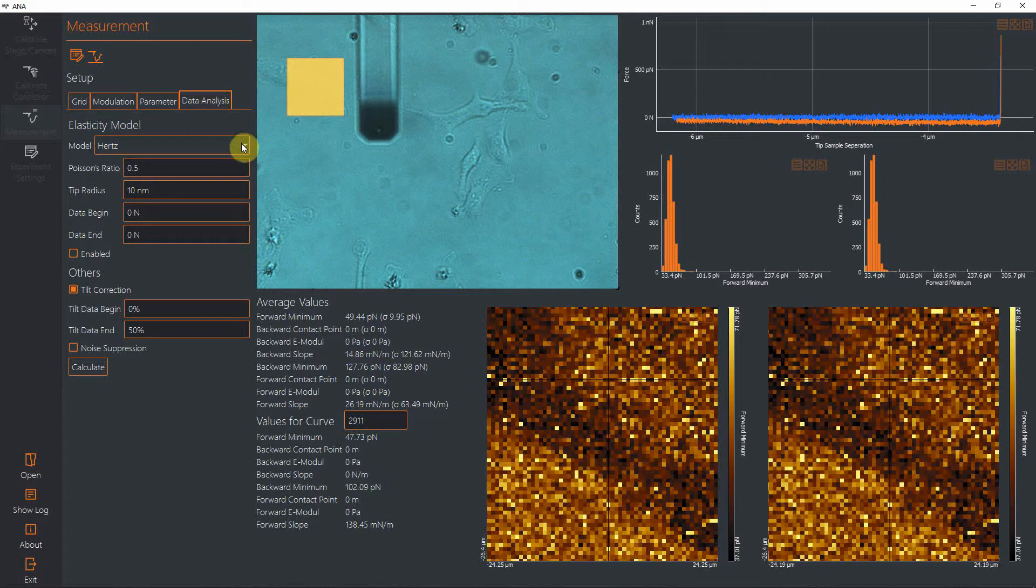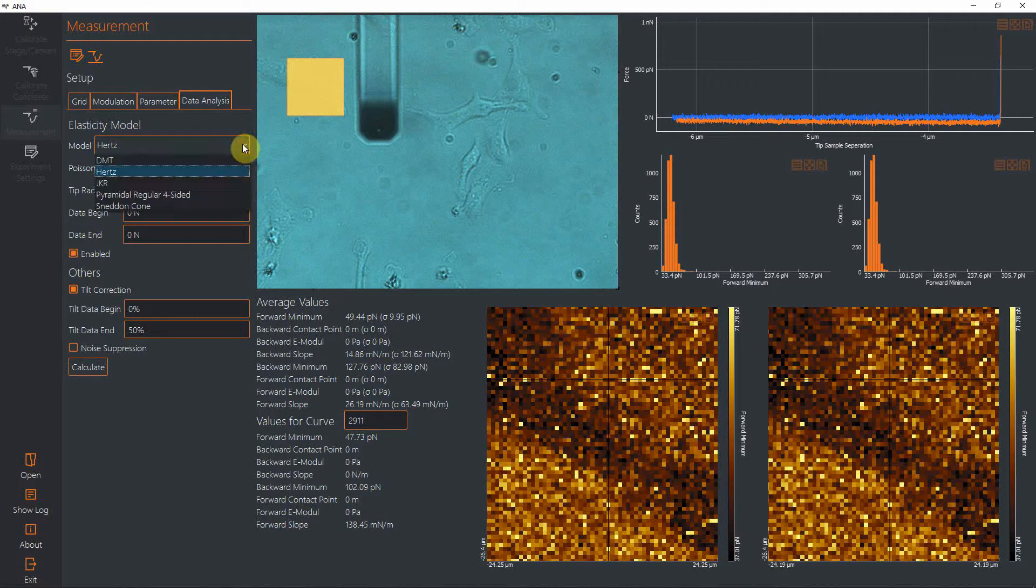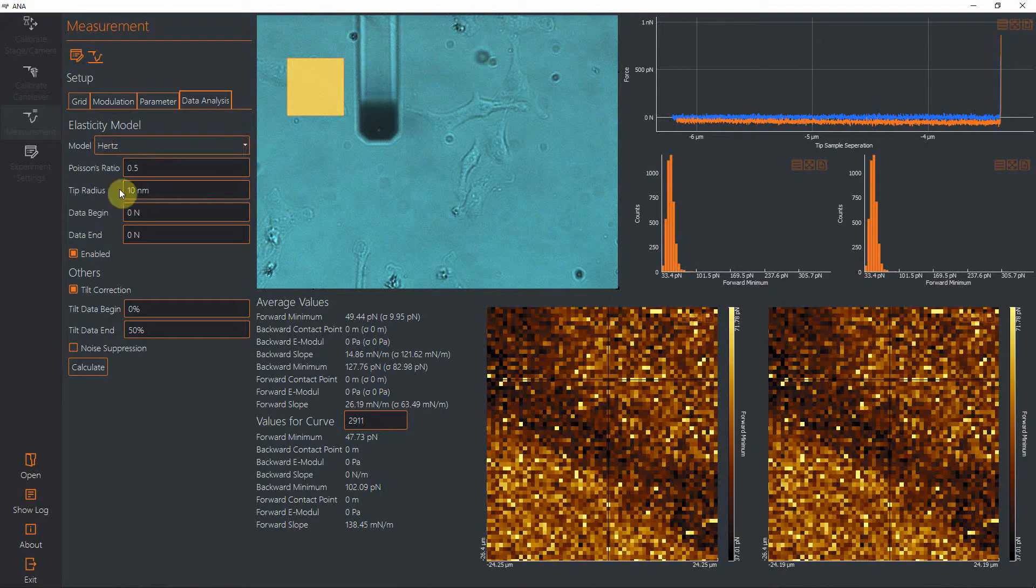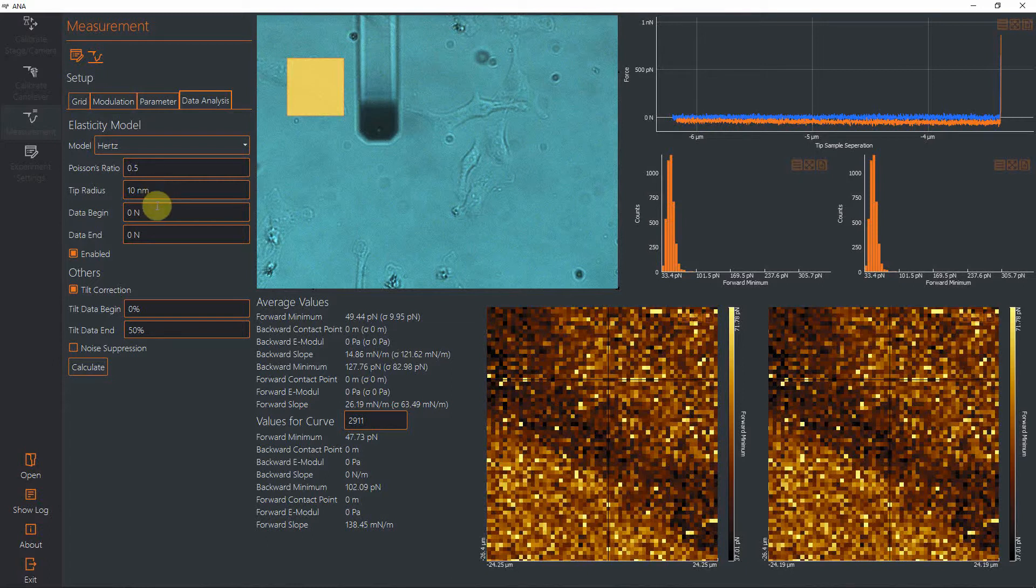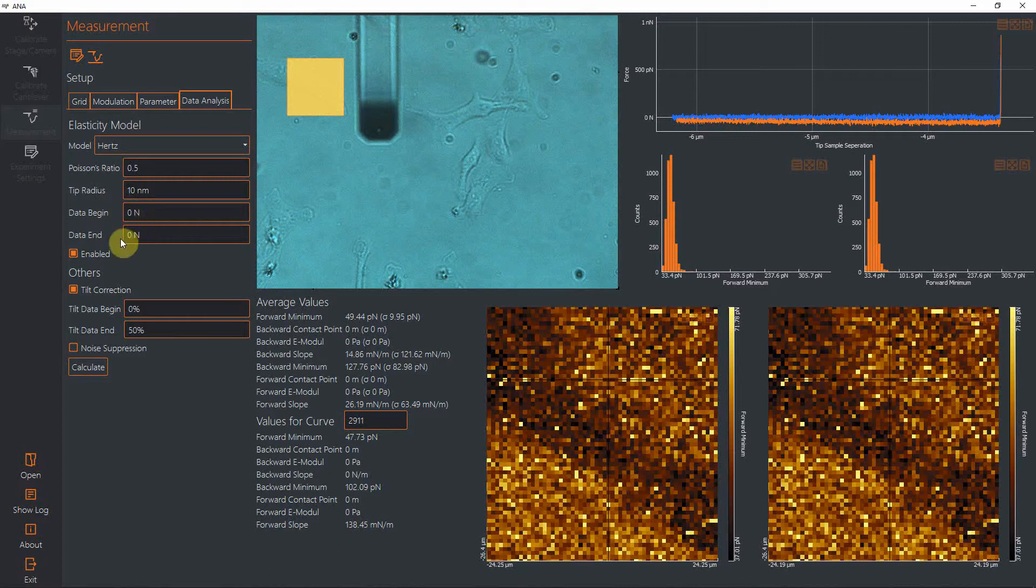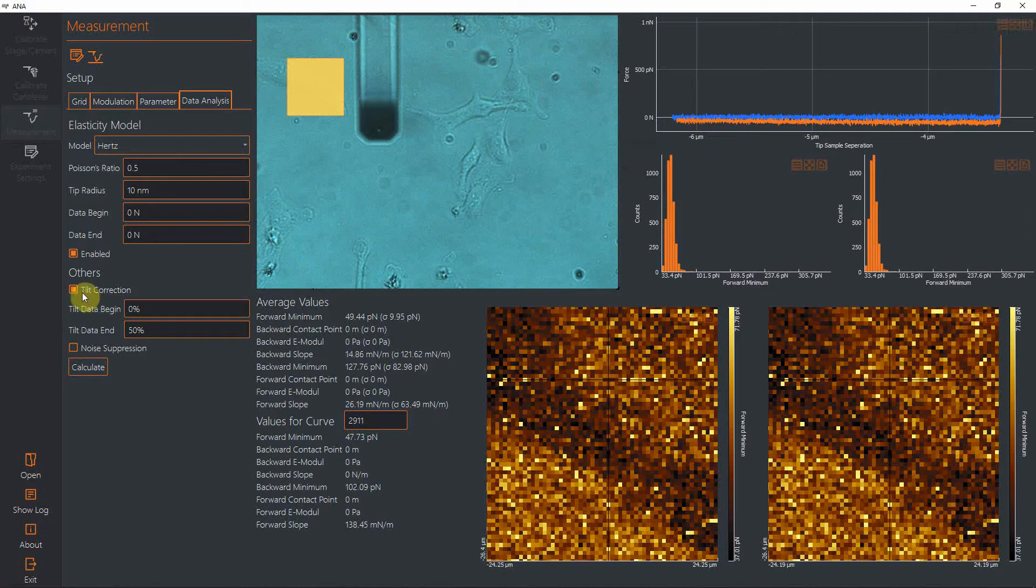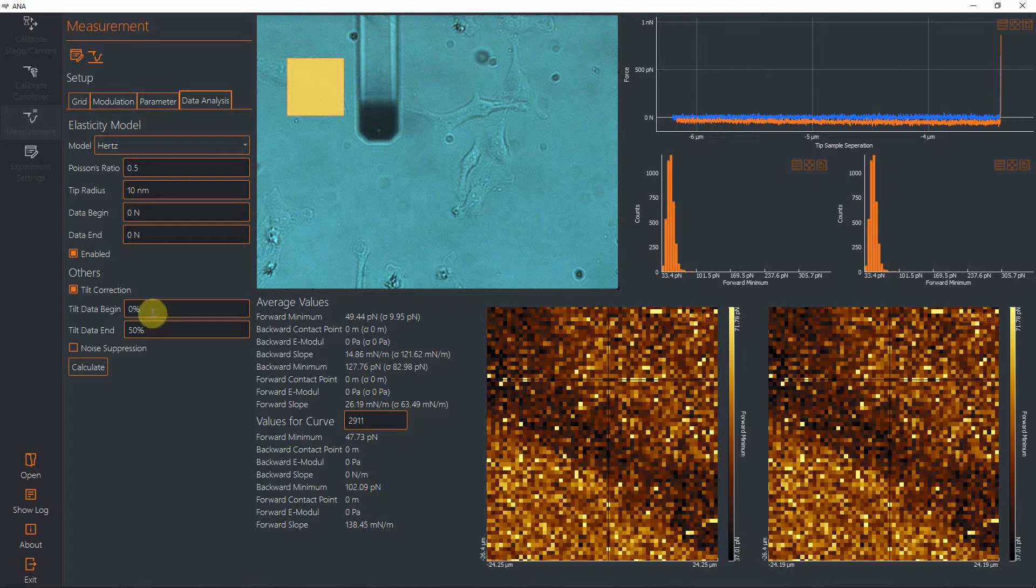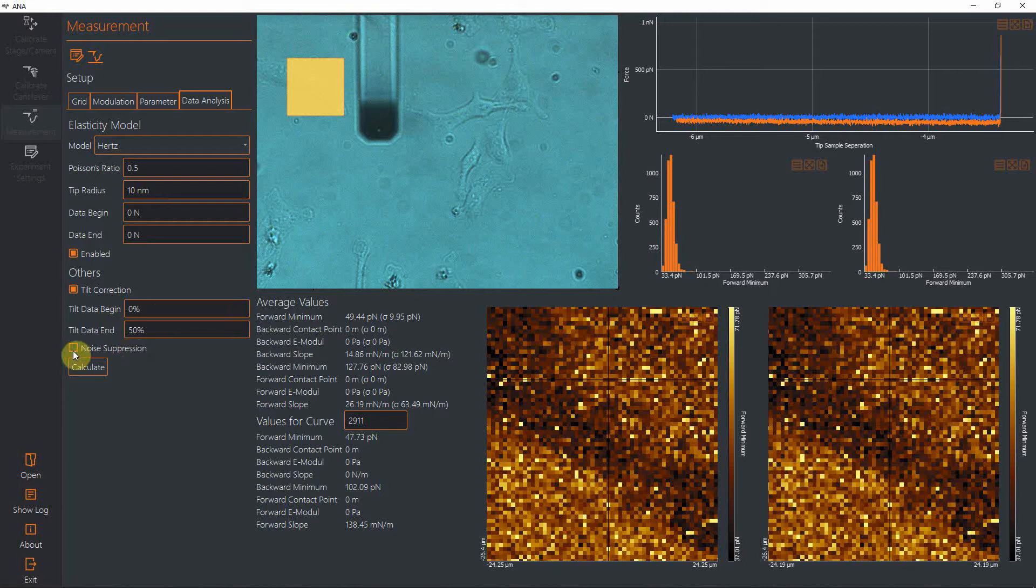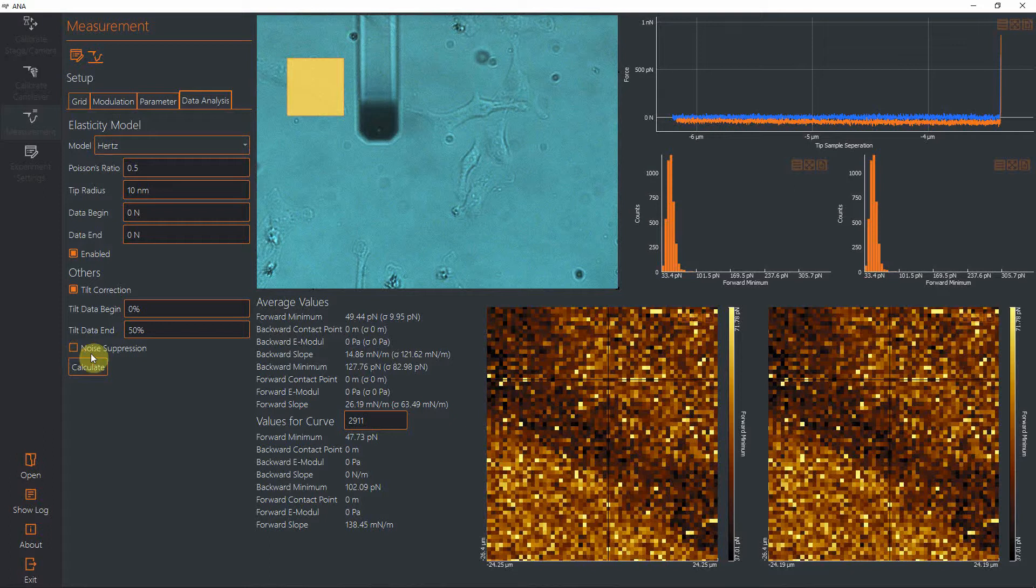In the data analysis, you can select to activate the elastic modulus calculation. You can select from different models here, and depending on the model selected, you have to give some parameters like the Poisson ratio, tip radius, or the tip opening angle. If you want to restrict calculation of the elastic modulus to a certain data range, you can also give here the force values between which the fit should take place. If the baseline is not straight but has a tilt, you can correct for this tilt. Here you can define which range of the force curve should be used as baseline, starting from the left going towards the right. If you have a lot of data points in a force curve on a short distance, you can also suppress noise from the readings.